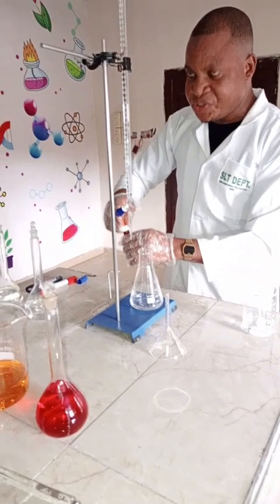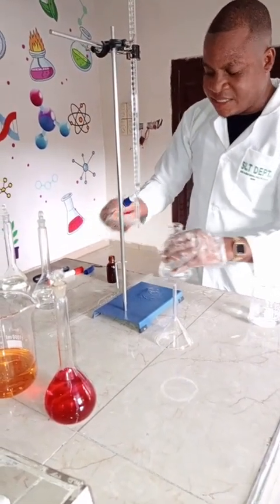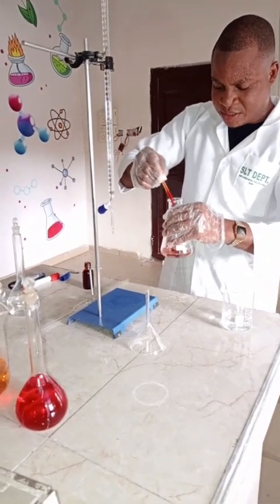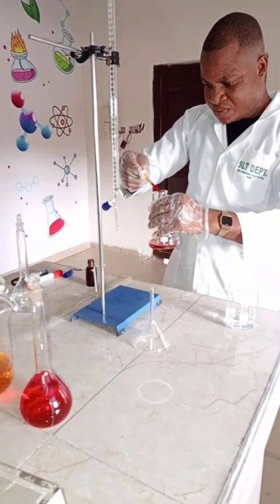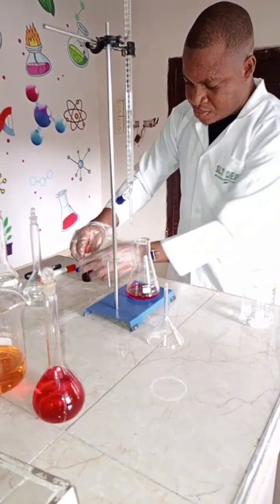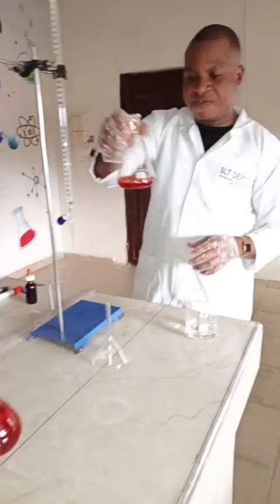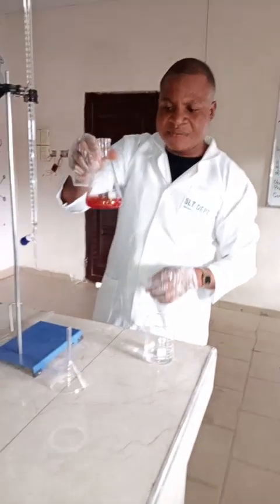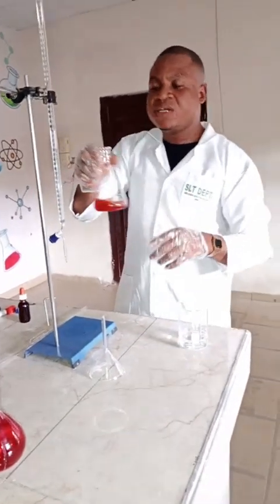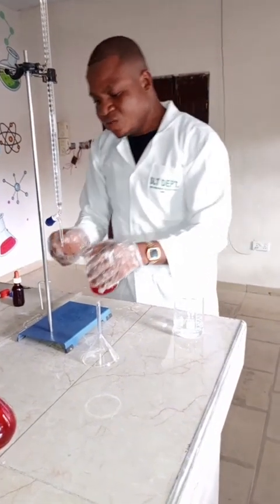I'm going to introduce 2 drops of the indicator: 1, and this is 2. Now this is what we have. This is our starting point. We are going to take it gradually until we notice a different color from this, our starting point. We are going to titrate.